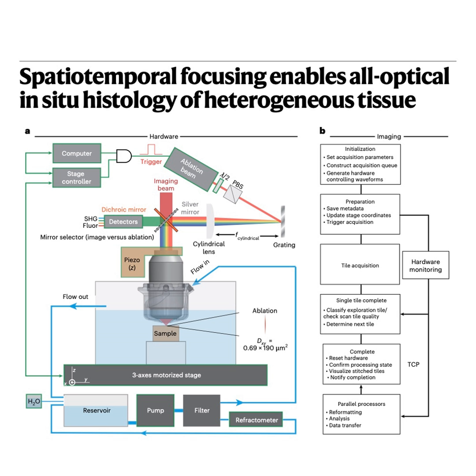The images clearly showed intricate details like the fine fibrous structures within the bone itself and even tiny microvessels running within cavities inside the skull dome. Wow, vessels inside the bone. Yeah. But the real showstopper was visualizing the boundary between the skull and the brain. They could clearly distinguish a blood vessel running within the meninges, the membrane covering the brain, from a vessel running just underneath it, on the surface of the brain itself, a pial vessel.